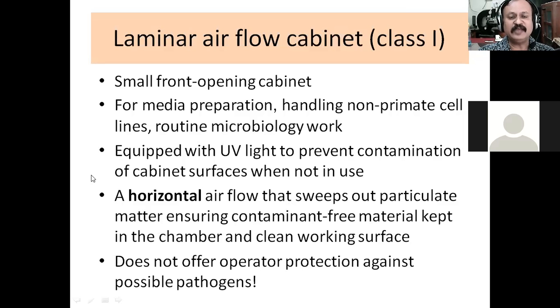And then if you are working in biosafety level 1 and you are using a laminar airflow cabinet, then this laminar airflow cabinet should be a class 1 type of biosafety cabinet. So what are the essential features of this kind of laminar airflow cabinet? That is written here on the slide. Firstly, there is a small front opening. The front of the cabinet can be opened. There is a door which you can slide up and down, or there could be hinges, so you can open up the door.